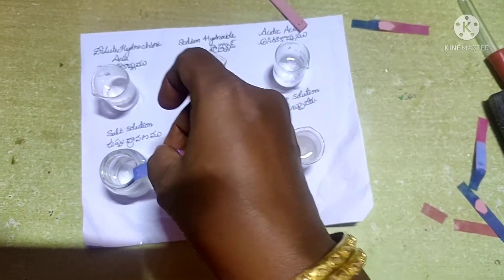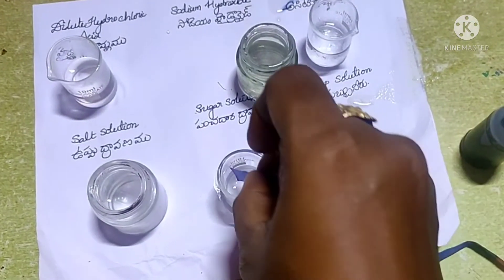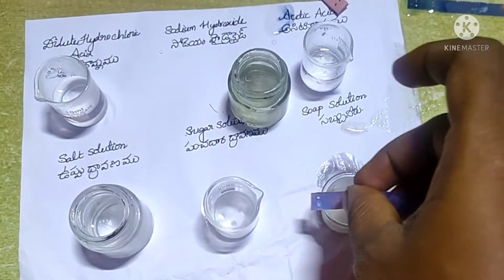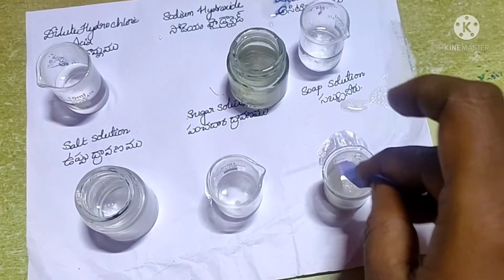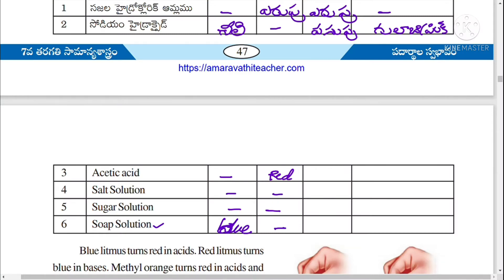Blue litmus will not change color in salt solution or sugar solution because these two are neutral solutions. When blue litmus paper is dipped into soap solution, it does not change its color. So we conclude: blue litmus turns red in acidic solution, and red litmus turns blue in base solution.